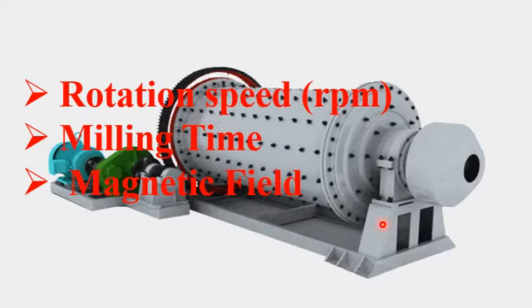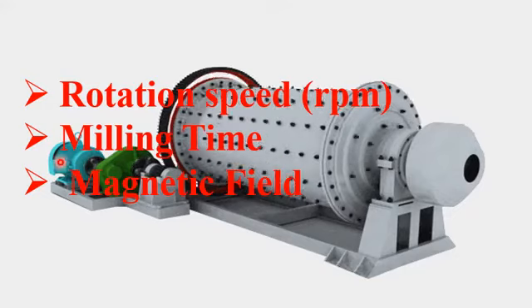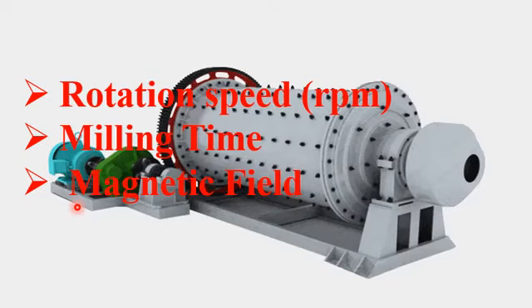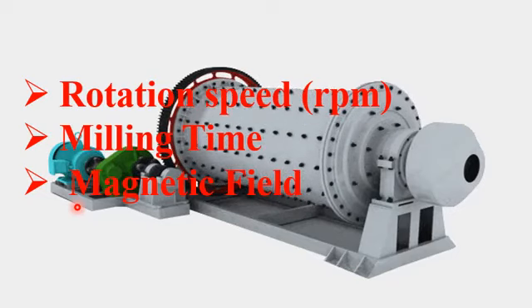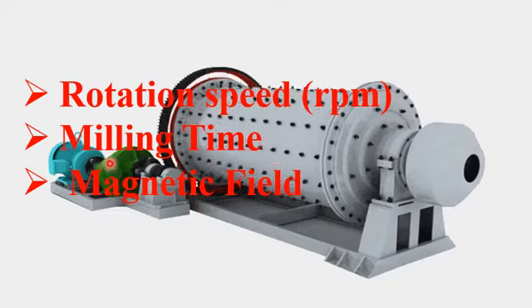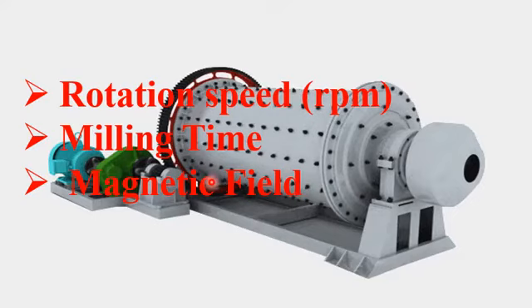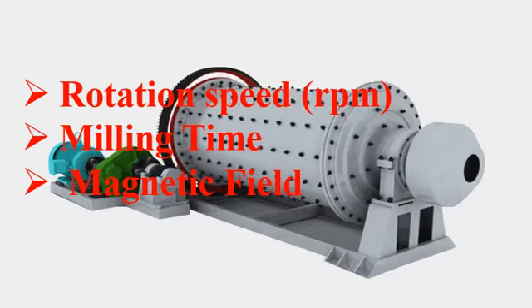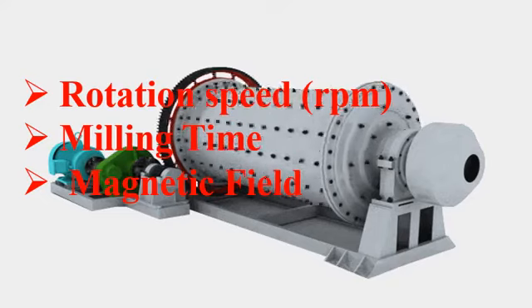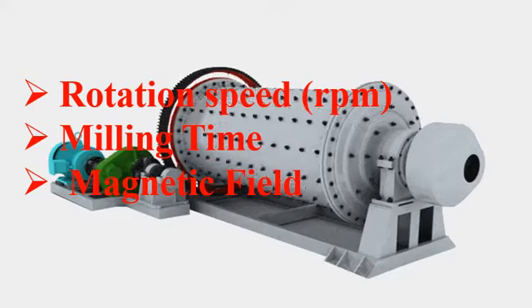So when a magnetic field is applied in a ball milling apparatus, there will be a generation of electromagnetic waves or electromagnetic field, and with this electromagnetic field, the magnetically and electrically active material will be separated from the impurities present in the ball mills. But dear student, this setup is used at advanced level. Usually in industries, conventional ball mill apparatuses are used.